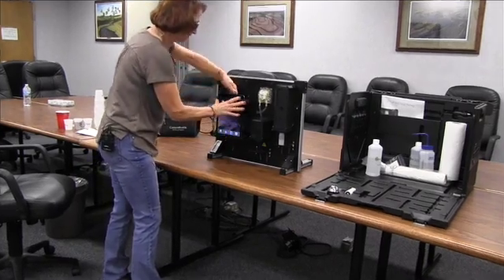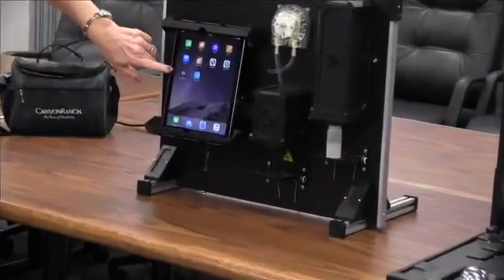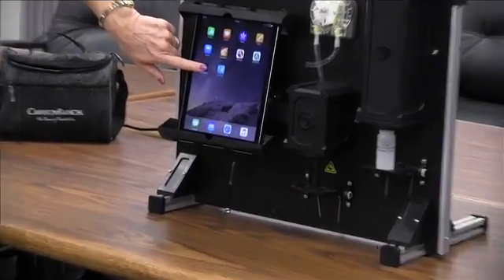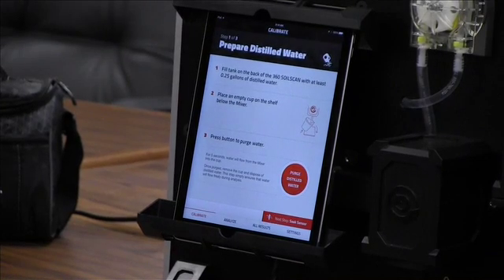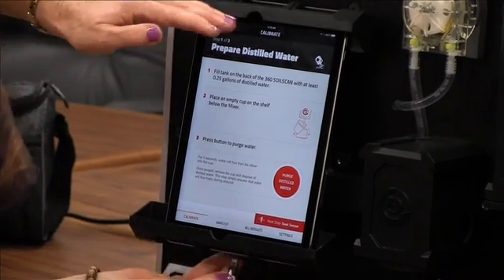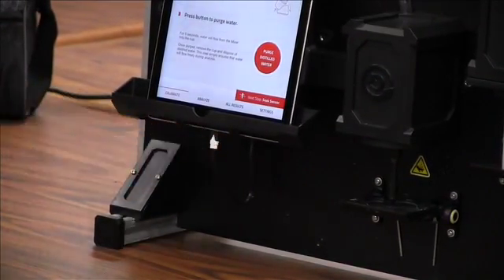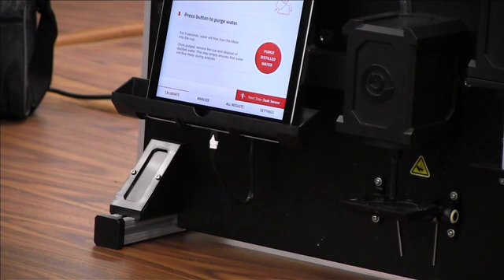On the iPad you should have the Apple app 360 Soil Scan. By clicking on it, it will automatically pair with the unit that is closest to it. It may take just a couple of minutes to pair up so the iPad is associating with this unit. You can also establish power to your iPad by connecting it right down here so you don't have to worry about the battery running low.